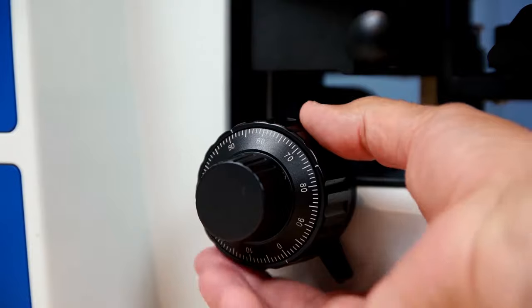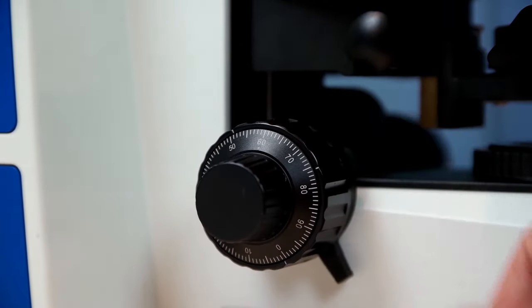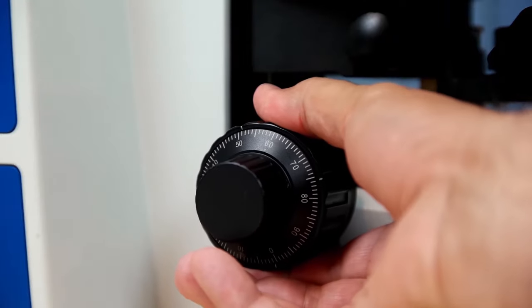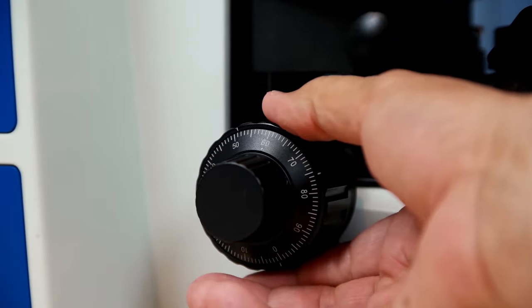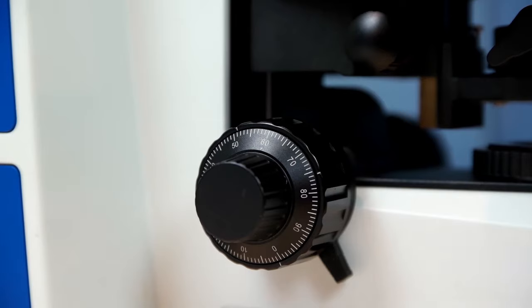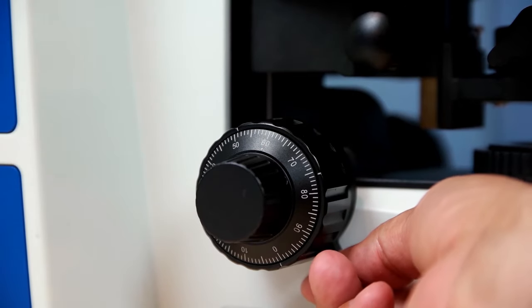The focus mechanism in this microscope is amazing. It has 1 micron precision and also 25mm range to move up or down, and it comes with tension adjustment.